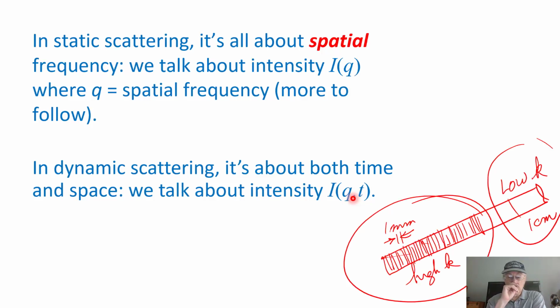Okay, so I want to talk a little bit about what this Q is, and we'll talk about this for a while. It's really how many tick marks are on your ruler. So here's a ruler with lots of tick marks on it, okay? And here's another ruler with just one tick mark basically, but we'll say there's another one there, all right? So it's really the resolution that you have.